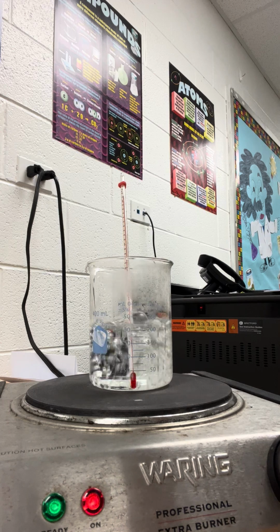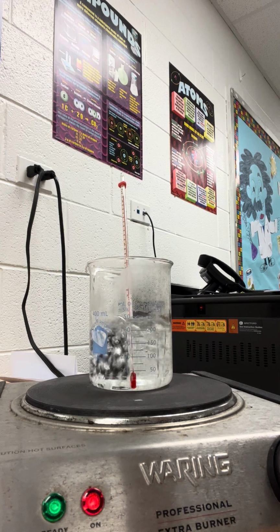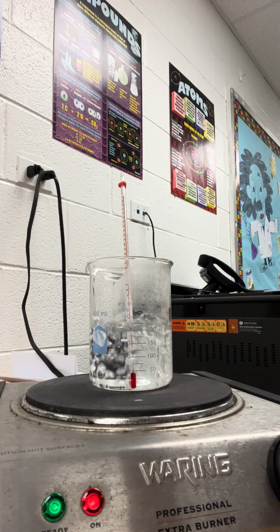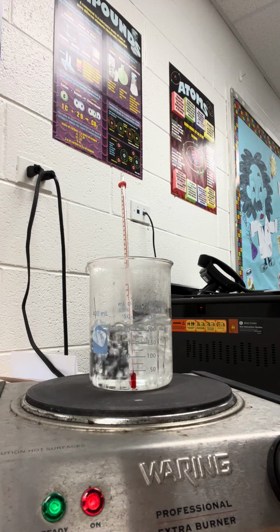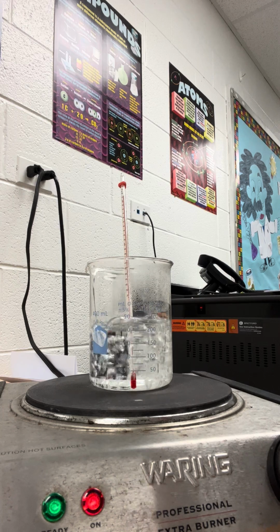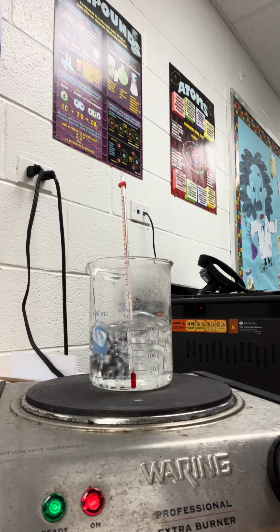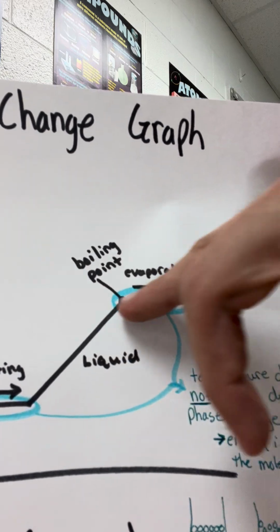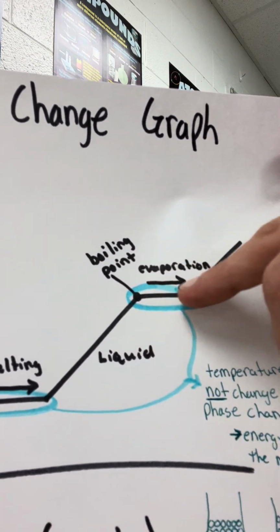So what you will notice is that around the boiling point, if we leave this here for another couple minutes, the temperature is going to stay the same. And that is because we have reached the second flat line of our graph. Evaporation, the second phase change.